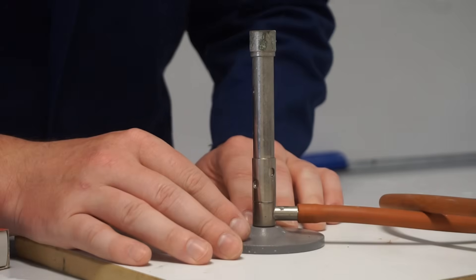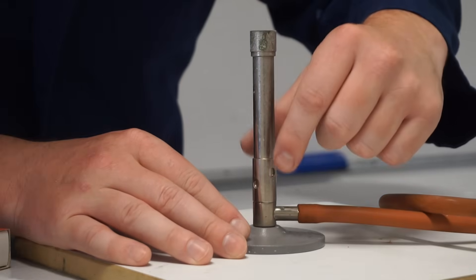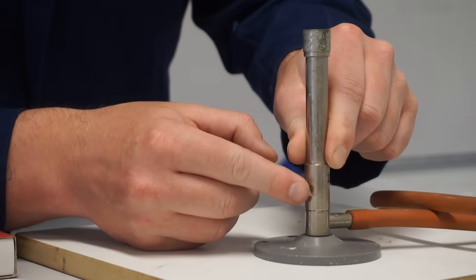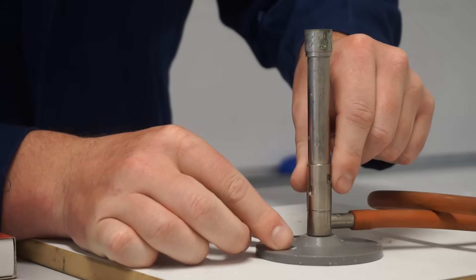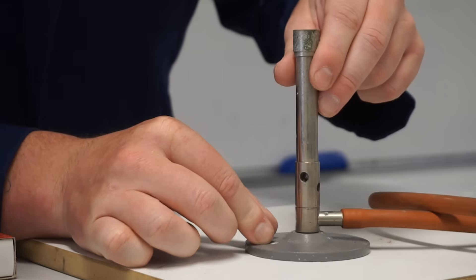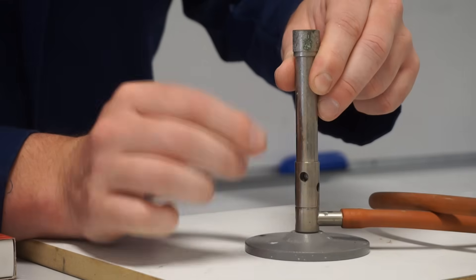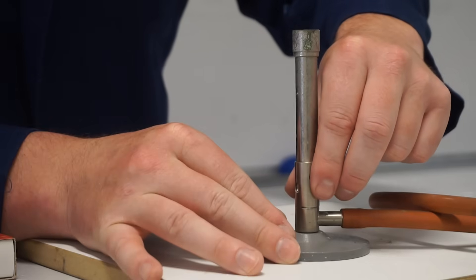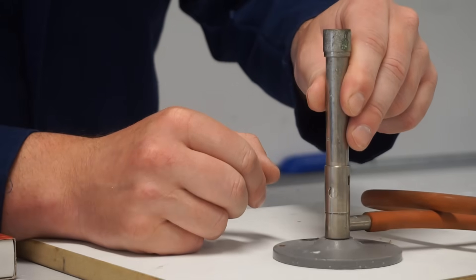We're about to light the Bunsen burner and we need to firstly ensure that this air hole is closed, that you can't see through this hole in the collar. If we turn the collar we can see that we open the air hole and we'll use that later on when we're heating things up but for now when we're lighting it we ensure that the air hole is closed.